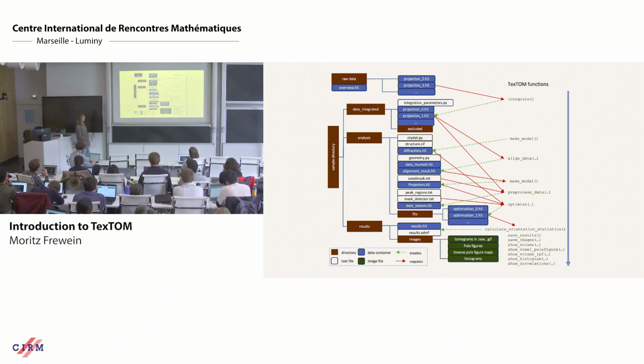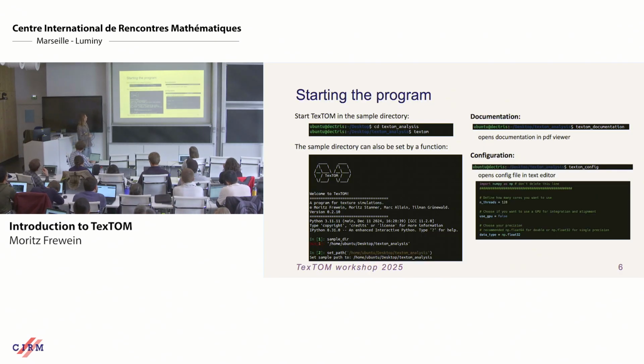So to start the program, basically you install it in a Python environment as you want, and it will give you the command TexTOM in your namespace.